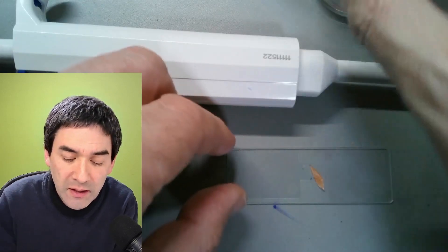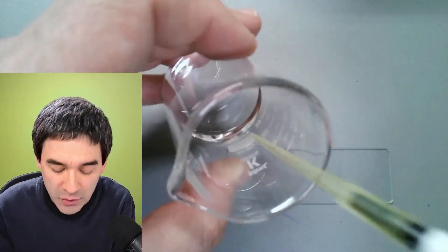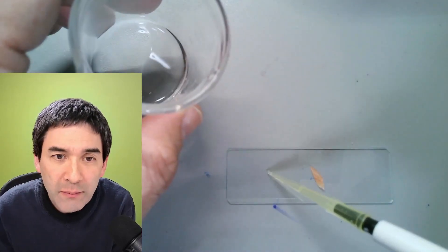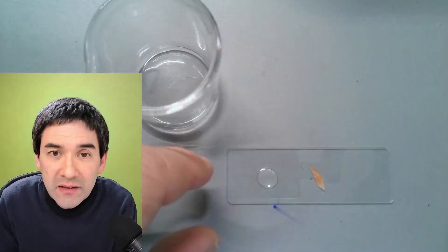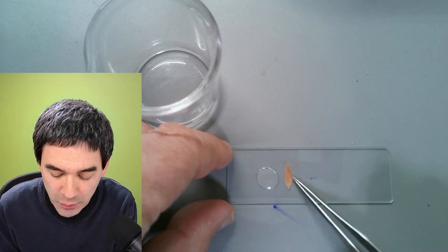So what I need to do is add a small drop of this vegetable oil now on the microscope slide. Usually I add a drop on the microscope slide first then I place the object into the oil. So I'm going to do this by simply pushing it over.